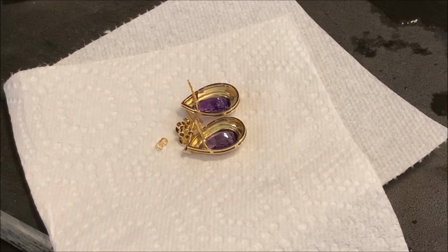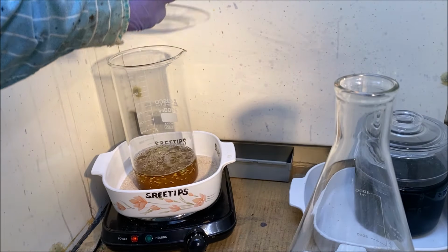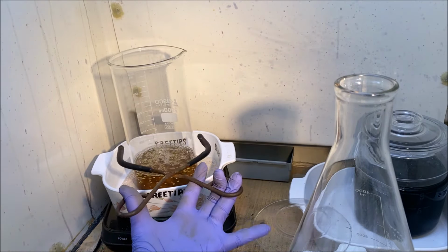Got them all cleaned up now. They should be nice and sterilized. No bacteria. Let's go ahead and get this hydrochloric acid boil poured off now.